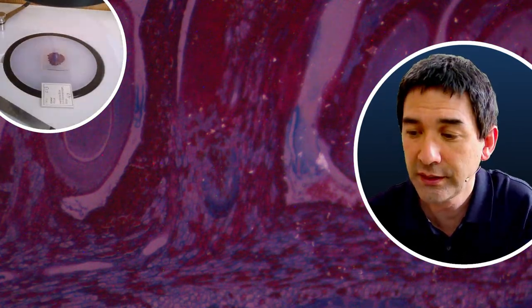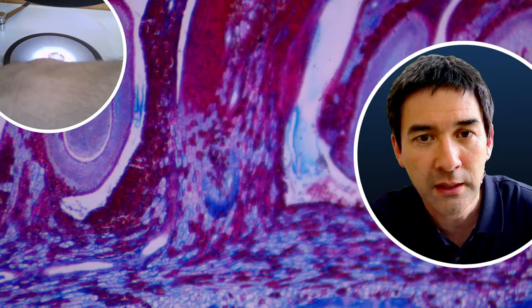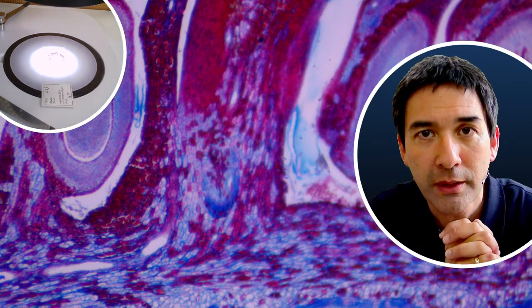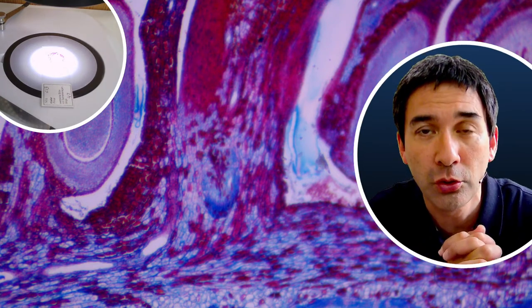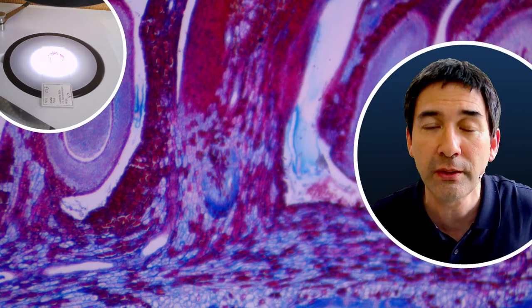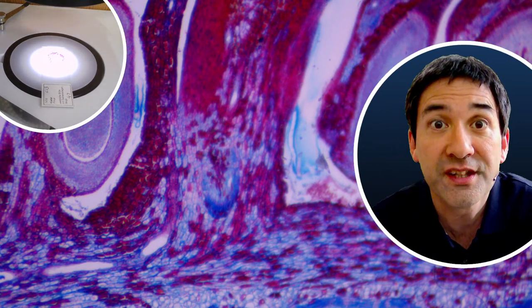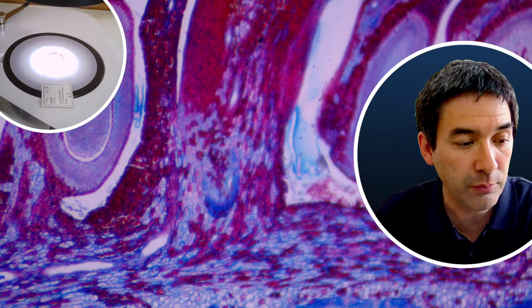I'd like to show the slide under the compound microscope as well. The image quality using a stereo microscope at high magnification cannot be quite as high as with a compound microscope because the design is simply different, but it works surprisingly well. For those new to microscopy: stereo microscopes are not strictly designed to observe slides like this — they have different strengths — but it still works surprisingly well.